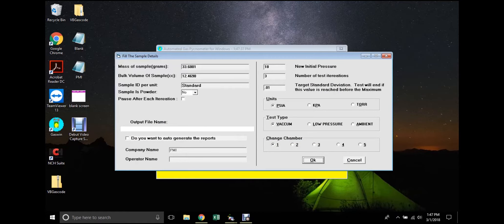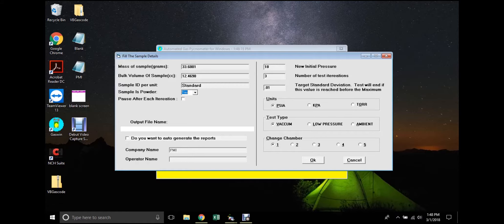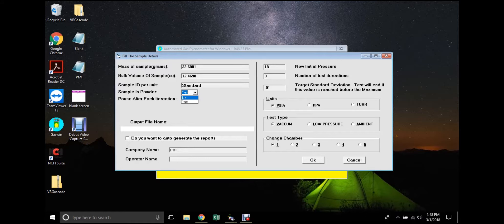There are fields for sample characteristics that must be measured by the user, including mass and bulk volume. There is an option to specify that the sample under test is a powder, which should be used if powders are tested, as this alters operation of the valves during testing to prevent dispersal of the sample. Note that this may increase the time taken to complete the test.